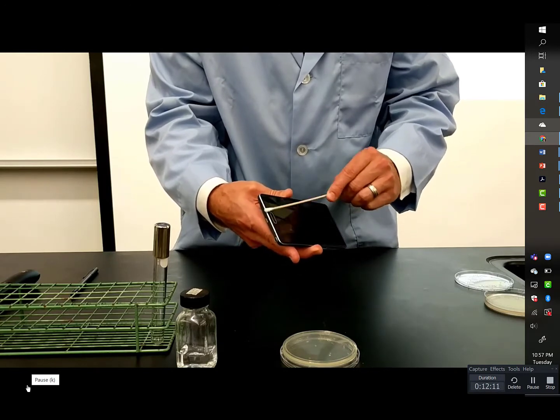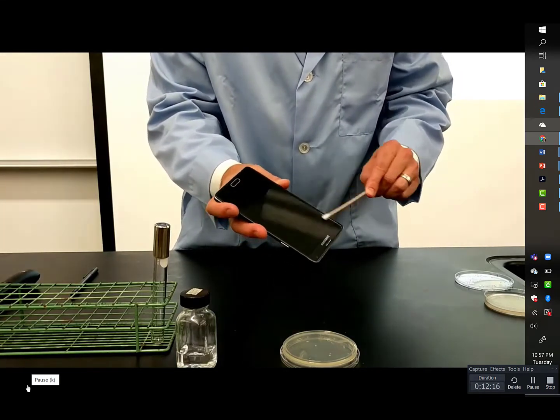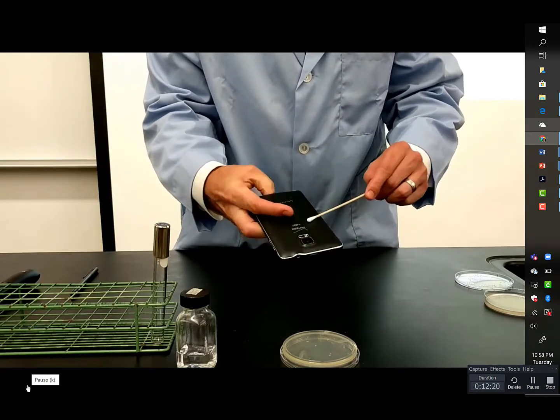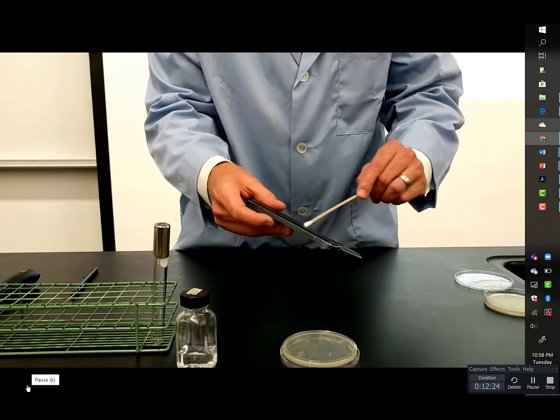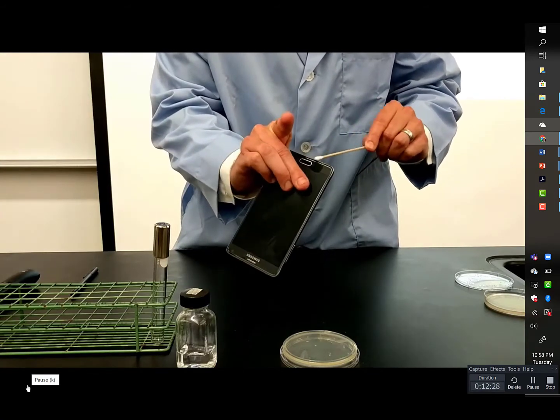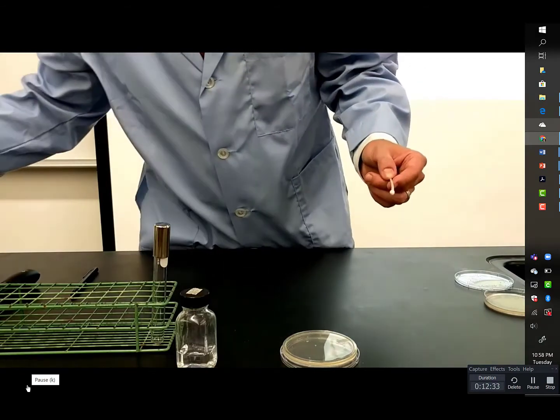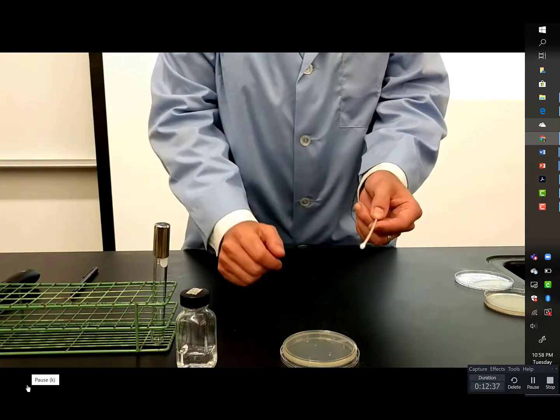All right, oil and water don't really mix very well. So I'm getting kind of extra thorough to go to different surfaces and just see, these are all places that my face or my fingers could touch, and we'll see which kinds of bacteria will be picked up from the cell phone.